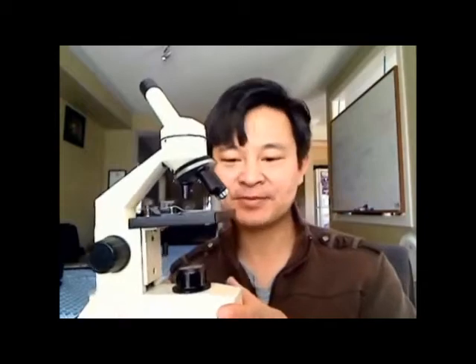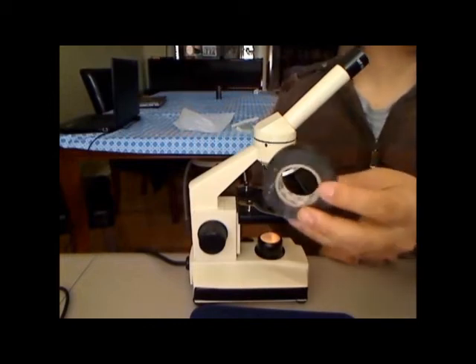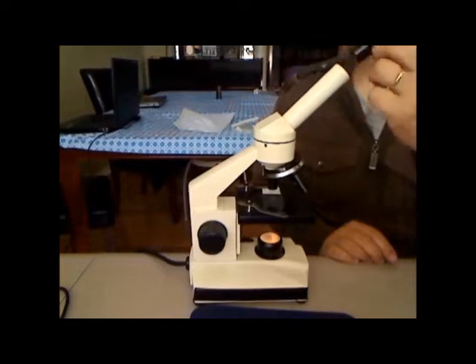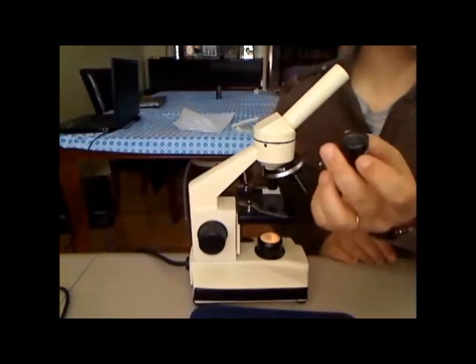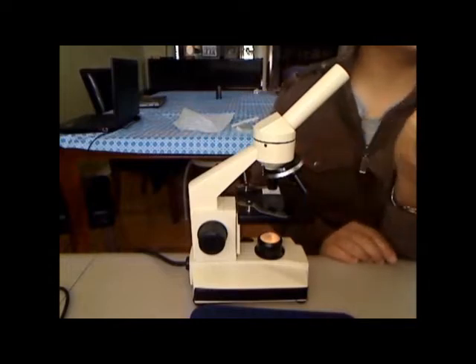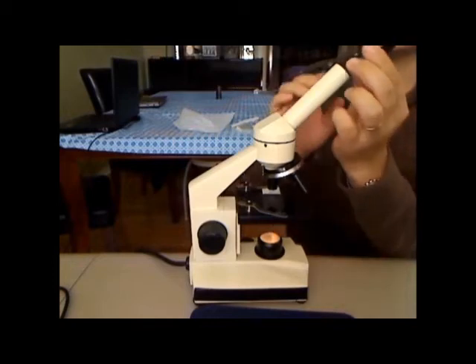Let's get started and I'll show you how to do this. What you need is black tape. We have to remove the ocular lens. Here's a trick — the simplest trick you could do: flip the ocular lens to the opposite side.